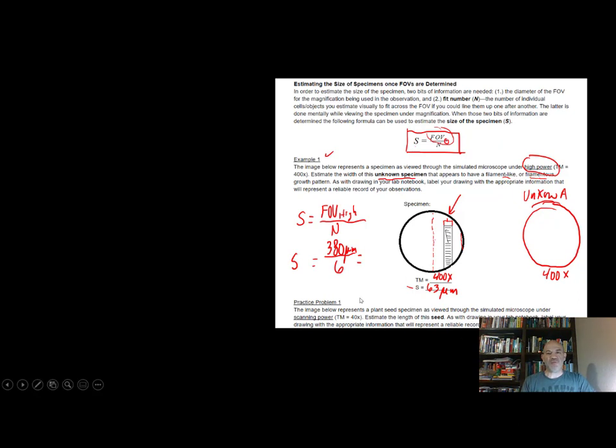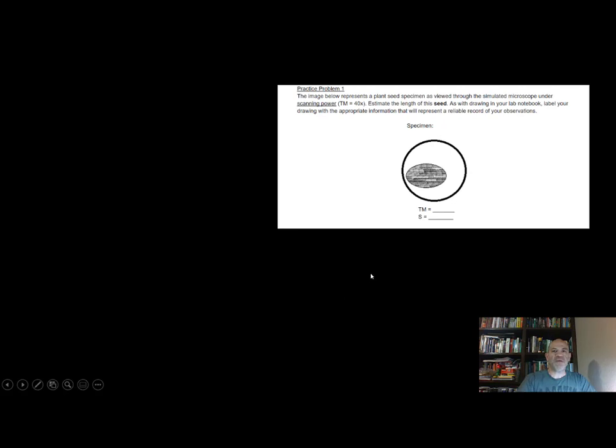Now, I do have some other practice problems on the handout that do this, so I'm just going to give a couple of pointers for you. This one is practice problem 1.